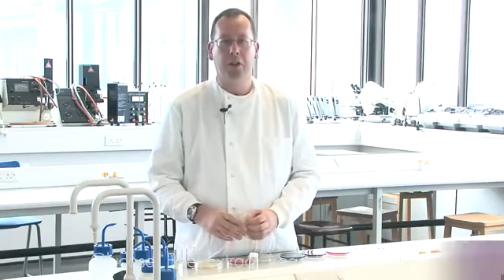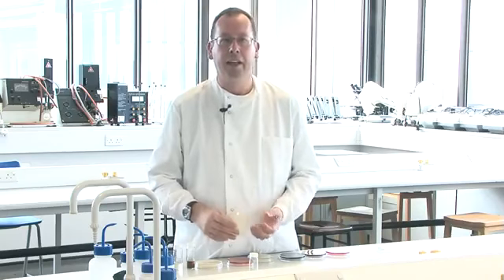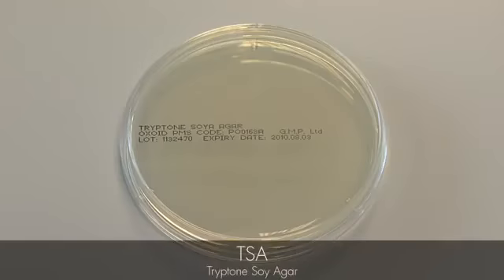The simplest media contains a source of carbon, such as glucose, plus something like beef or yeast extract to provide nitrogen and amino acids, along with trace amounts of various salts. An example of a simple or basal medium is nutrient agar or tryptone soya agar, as shown here. Non-fastidious organisms such as Staphylococcus aureus and Escherichia coli will grow easily on this medium.